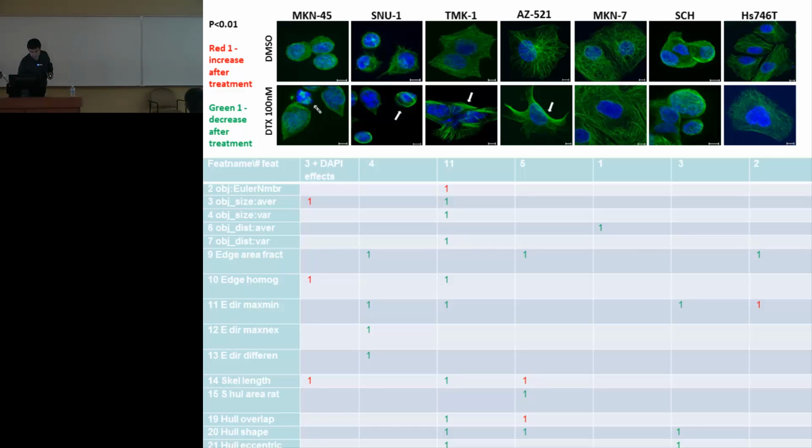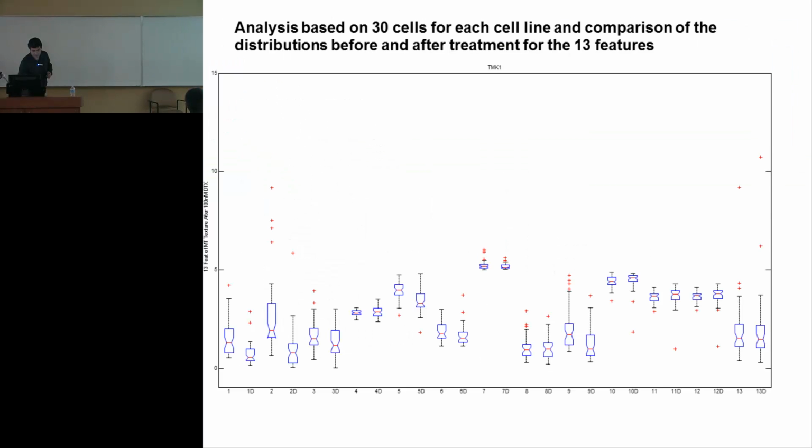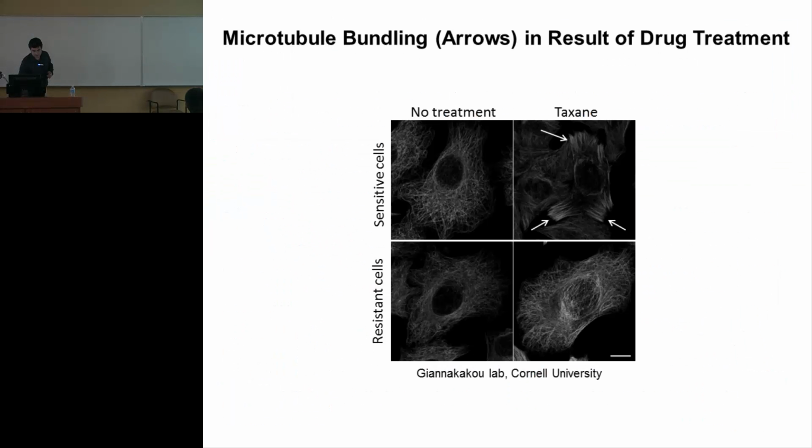In this one, it's not necessary that you segment and identify the cell. You are looking at some properties like orientation and angles and so on. For example, this image. Here, this cell is not responding to treatment. We have before treatment and after treatment, and they look very similar. This one, for example, what we have is these fibers.